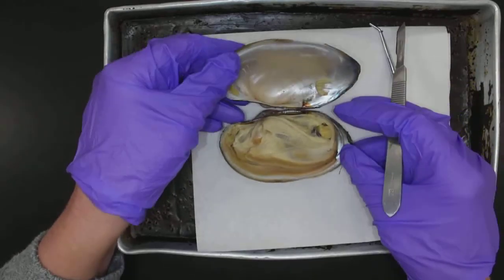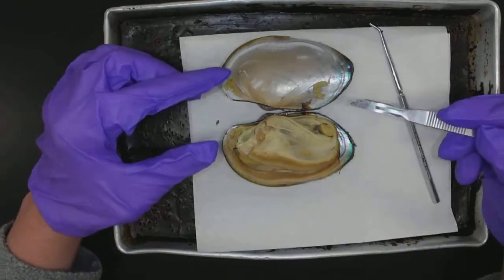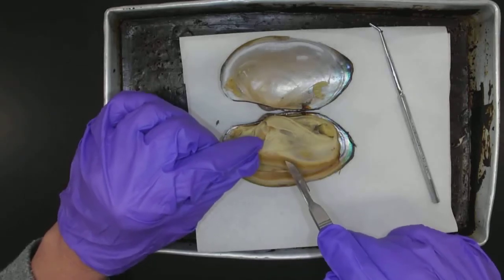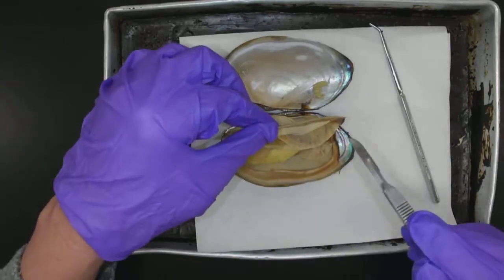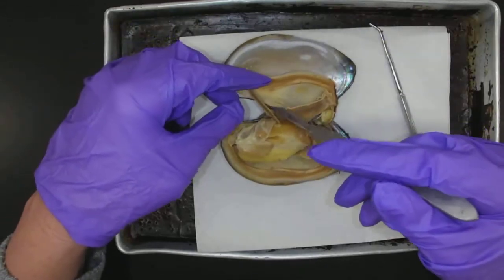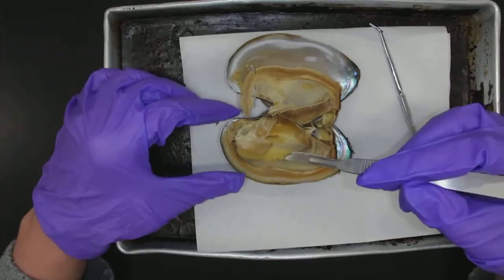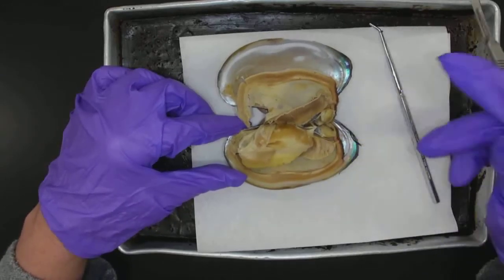Now the clam is open. So we can see why it's called Class Bivalvia — because there are two sides to the shell. And the shell is secreted by a structure known as the mantle. So this is the mantle. If your mantle gets ripped, don't worry — it often does when you're first opening it up. I'm just going to peel this back so I can see the structures underneath. Let's move that gently aside, because remember in dissections it's about being able to see the features of the animal — that's why we're doing this. We want to be able to learn and understand, so we don't want to wreck anything.